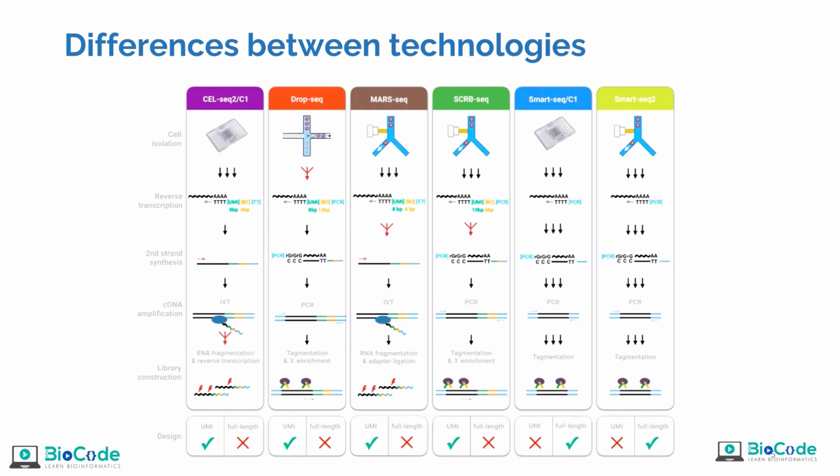So no matter what we attach with our transcription, either barcode, UMI, or PCR adapter, we do have to do second strand synthesis. This is where we prepare the second strand. And after second strand, we do cDNA amplification. We have to do PCR. Some technologies, CEL-Seq and MAR-Seq, utilize the IVT procedure, whereas other, most commonly utilized technologies do PCR amplification. And this is where the library is amplified.